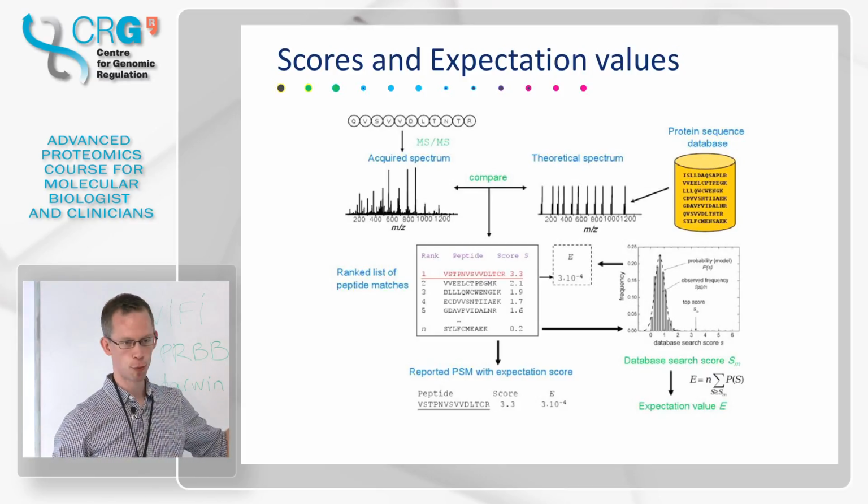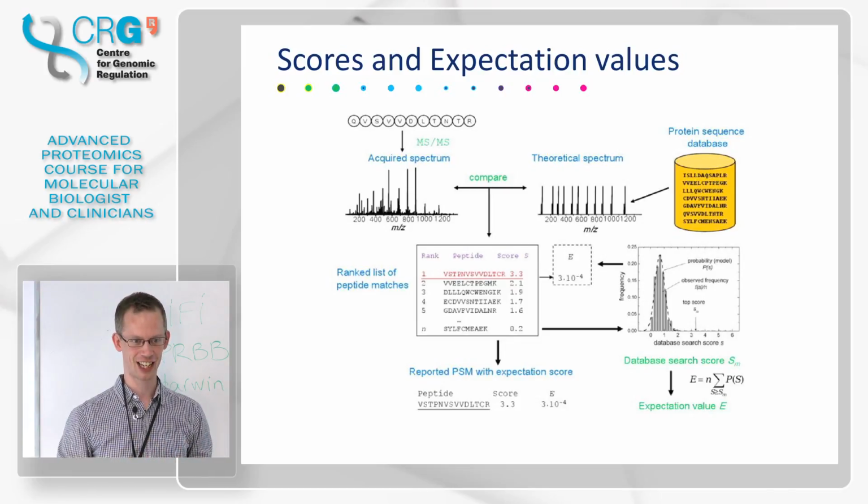For this, it actually works on the individual peptide. So it's just one spectrum, and then you're looking at that. But I'll get back to it when you look at multiple, because that's exactly what we have here. So maybe I can just wait a few slides and then come back to your questions.